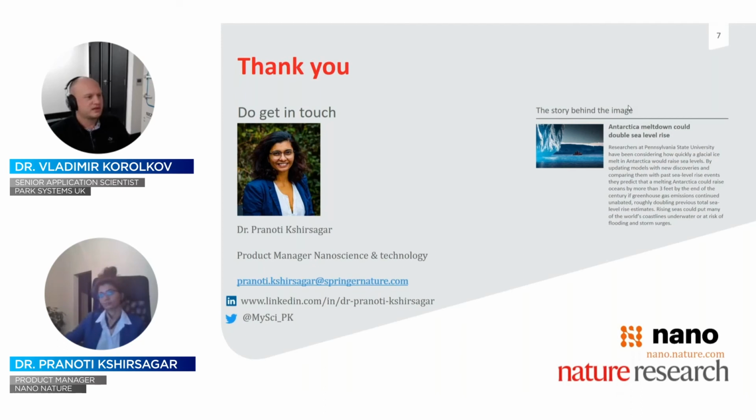Right, Natalie, thank you for raising a quite important question here. Indeed, you can use that high eigenmode approach in almost any media that is compatible with your microscope and your probe. You can certainly use all high modes of the cantilever in water, and that's something that I used, and you can get similar results.